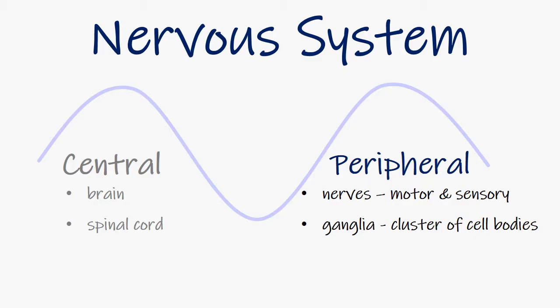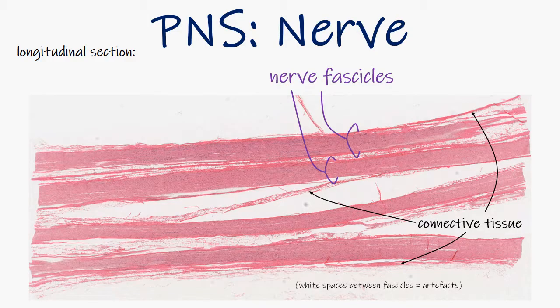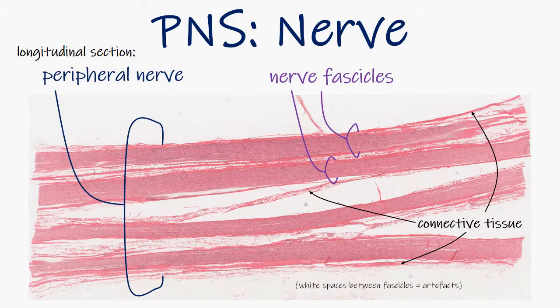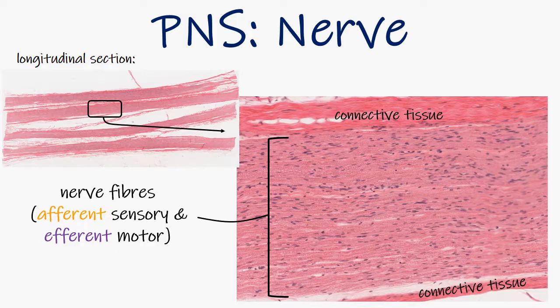So let's now move on to examples from the peripheral nervous system, that is, nerves and ganglia. Here is a beautiful longitudinal section through a sciatic nerve. When looking at nerves, you can apply the same spaghetti logic for longitudinal and cross-sections that we did when I introduced it in the muscle video. This light micrograph nicely demonstrates that peripheral nerves are composed of bundles of nerve fascicles, and that these bundles of fascicles are bound together by connective tissue to collectively compose a peripheral nerve. If we move to higher magnification and look more closely at an individual nerve fascicle, you can see that the wavy eosinophilia is the individual nerve fibers traveling through the fascicle.